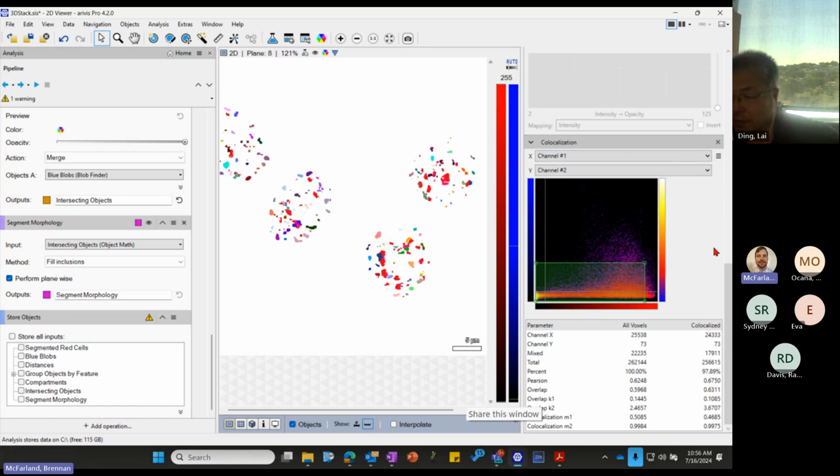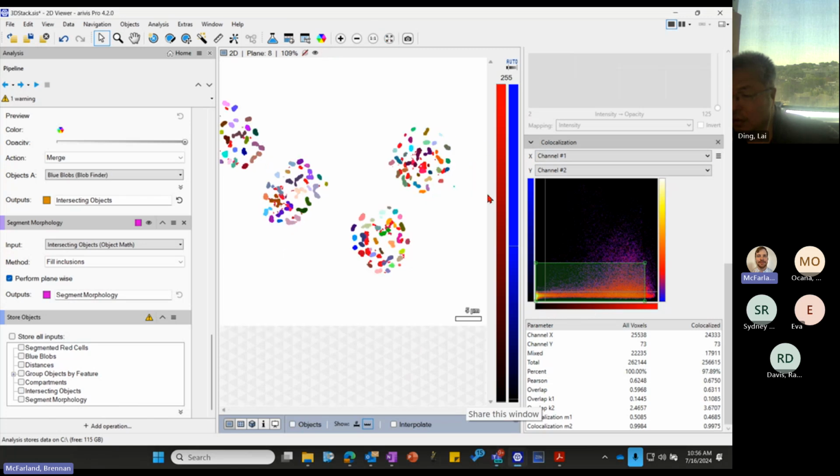If this is of interest, I can look a little bit more into it, but usually when I look at colocalization, I look at the volume of the objects generated, because sometimes the intensities may not be the best readout of colocalization, especially if your immuno is not normalized.